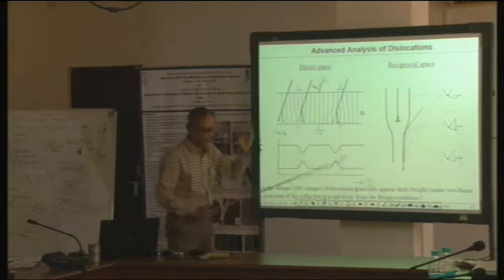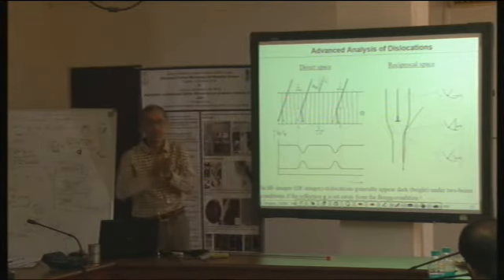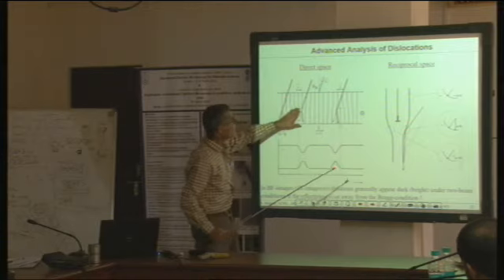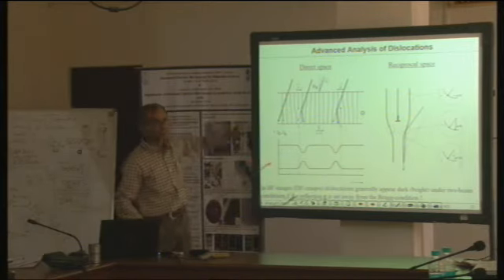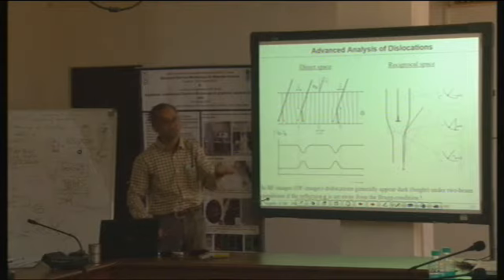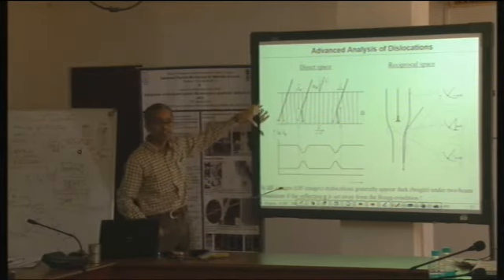Here there is a trick. For example, on an overall structure I am away from the diffraction condition, which means that except around this part, everywhere else I am away from the diffraction condition because everything else is more or less the same. But around this part, there is a chance that I can get back locally into the Bragg diffraction condition. That may happen either on this side or on this side, depending on how everything is formed.